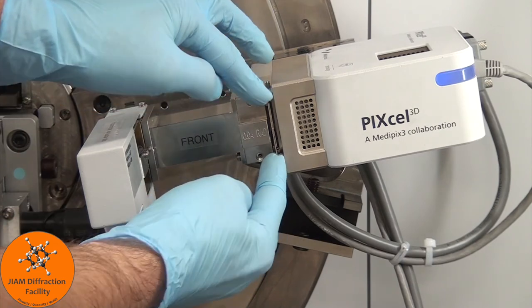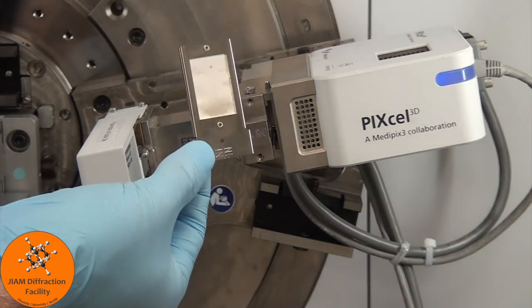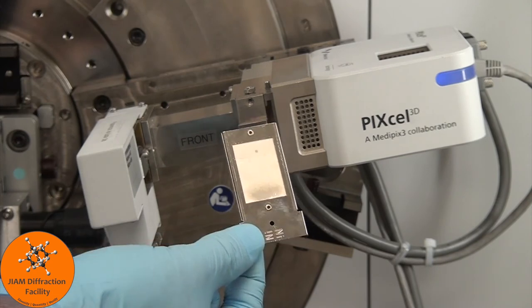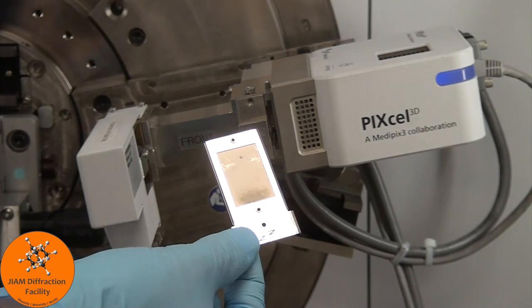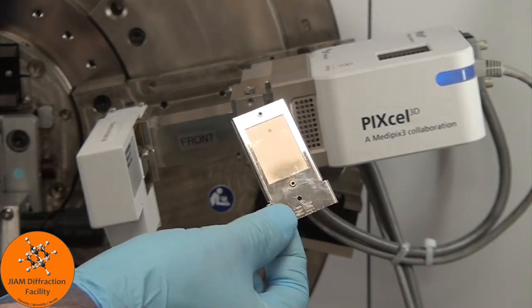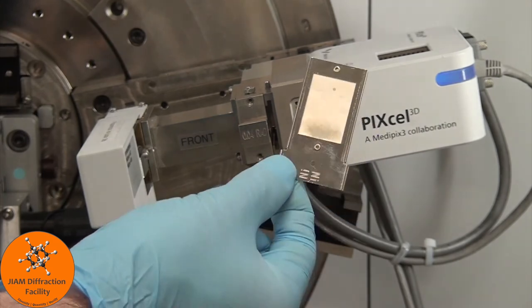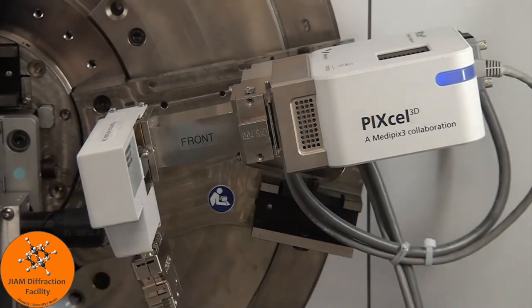Here we have the nickel filter. You can see nickel down there by my thumb. What this does is that it absorbs K beta radiation. Ideally we would like a monochromatic X-ray beam, but we really have about three wavelengths, K alpha 1, K alpha 2, and K beta. Each one of those will produce its own set of peaks. So if you don't have this nickel filter in there, you will see extra peaks in the diffraction pattern. But we like to include this to get rid of that extra wavelength.